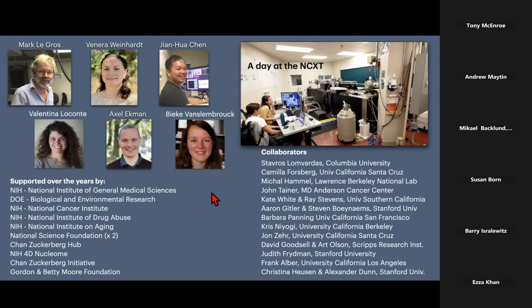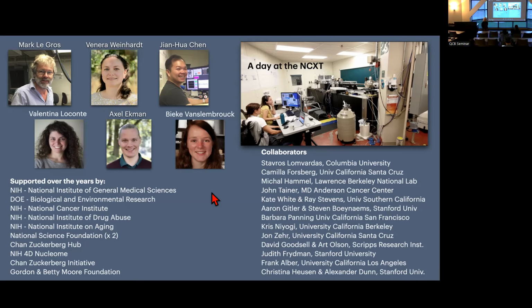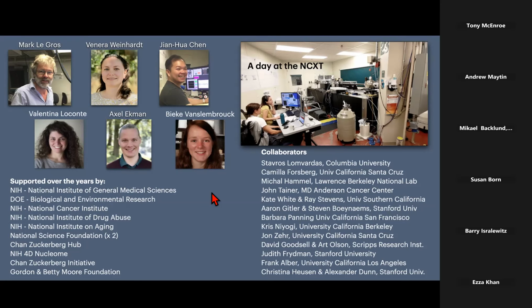Anyone else? I had a question, thank you for talking about this. I had a question about the symbiont vision. You showed a series of images, but those weren't the same cell, right? Unfortunately, no, after one tomogram, they're gone, nobody gets out alive. It's a one-way trip in there. So it was a number of different cells over time. That makes sense. Yeah, thank you.